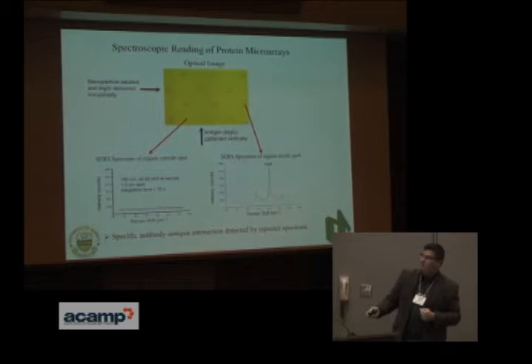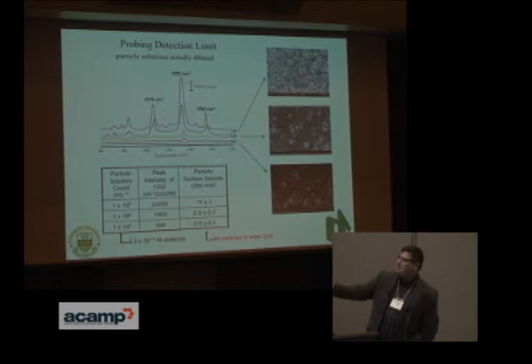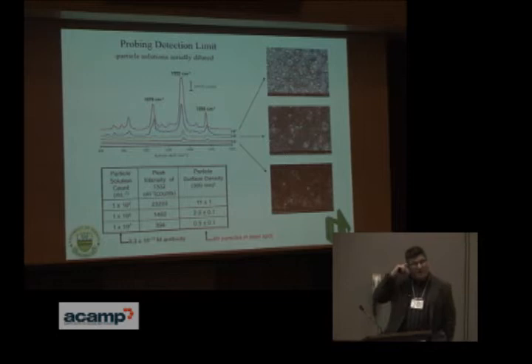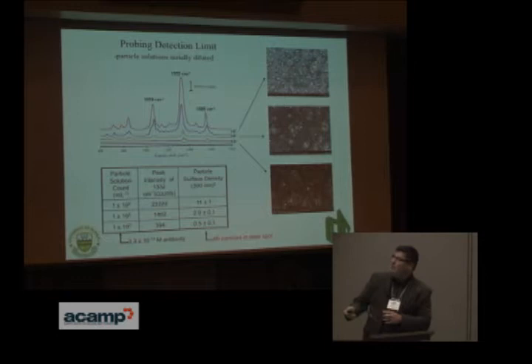In terms of how low can we go, here's a series of spectra for different concentrations of the nanoparticles. We've done this with different concentrations of the antigen as well. As far as we can figure, we can detect approximately 80 particles in our laser spot, which is very, very low levels. And in a sandwich assay, we've gone down to about 40 picomolar for detection of an antigen that's sandwiched in between two antibodies. So it's starting to approach the lower levels of ELISA.